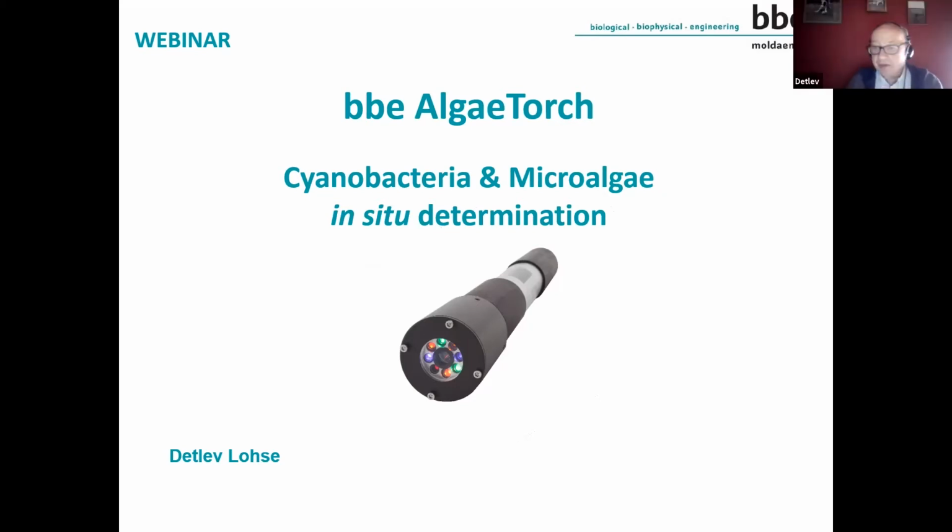Thank you very much, Carrie, for this kind introduction. Today I want to talk about the AlgaeTorch. The name says it already: AlgaeTorch means that we deal with algae here. And as already described, we are looking for the measurement in situ, which means that we use such an instrument, shown here in the first slide, in the field.